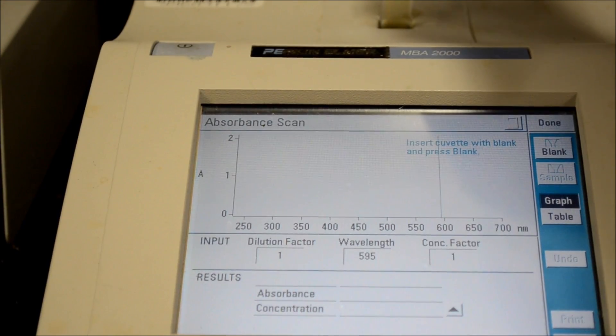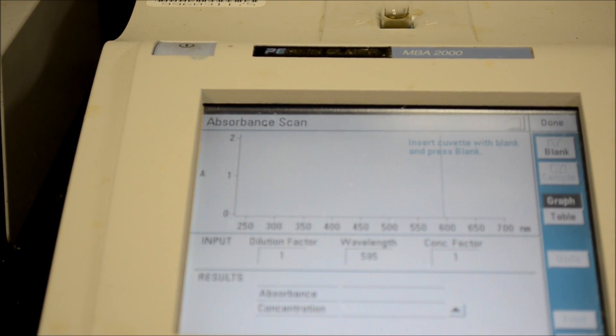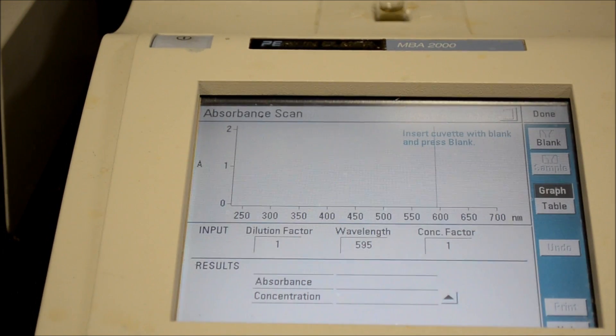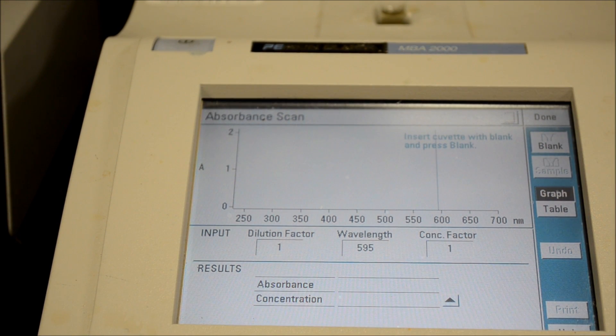First, you want to measure the blank to set a baseline. For this, you need a spectrophotometer set at 595 nanometers. Insert the blank and press the blank button and wait for the spectrometer to read the blank.